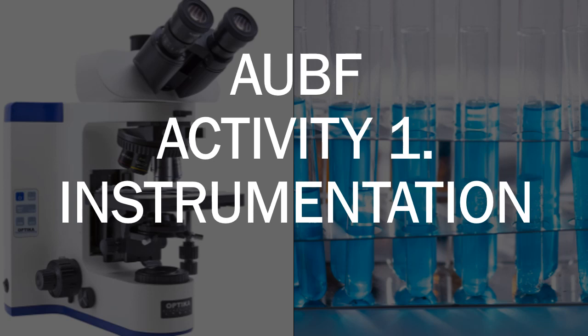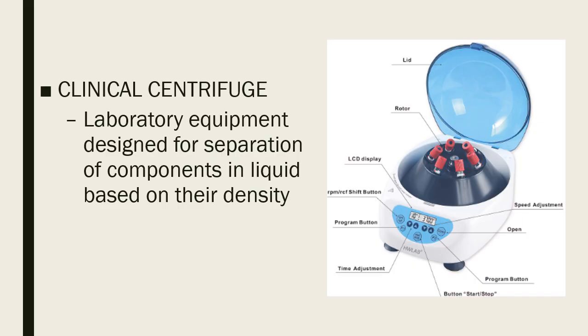And so let's take a look at your Activity One, instrumentation. Okay, and so under this, we'll also be talking a bit about laboratory safety in this presentation. Okay. And so your clinical centrifuge.